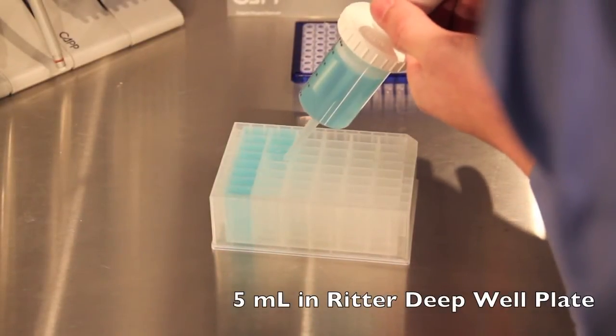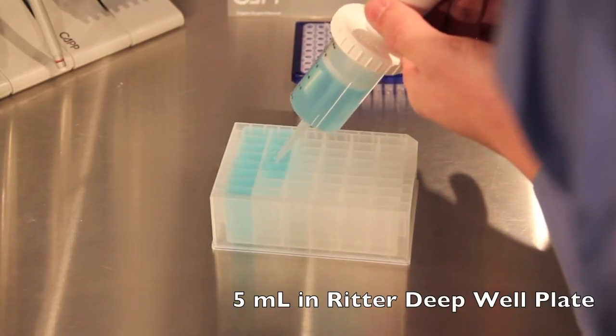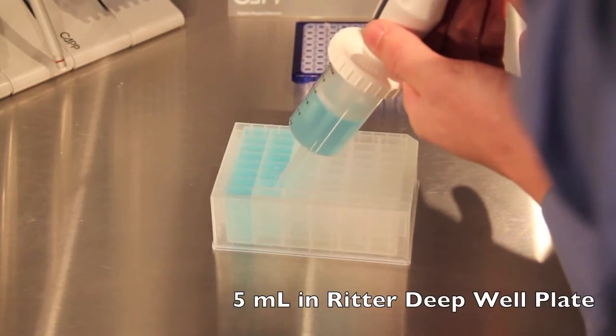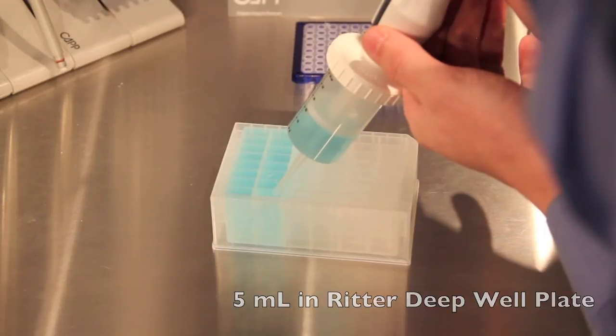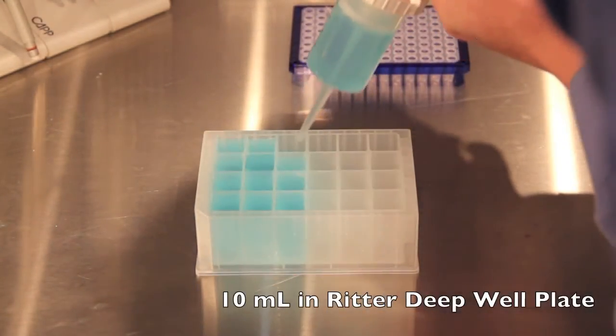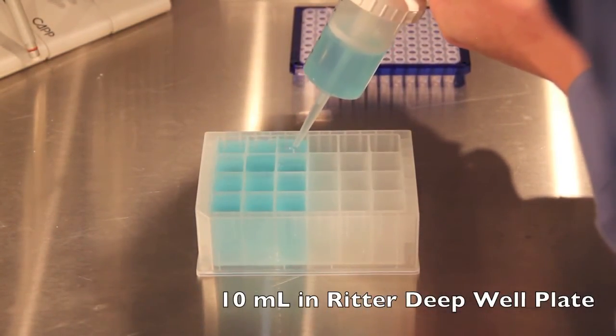Using the same 50 mil syringe, we can put 5 mils into our Ritter deep well plate. And here we are putting 10 mils into our 10 mil Ritter deep well plate.